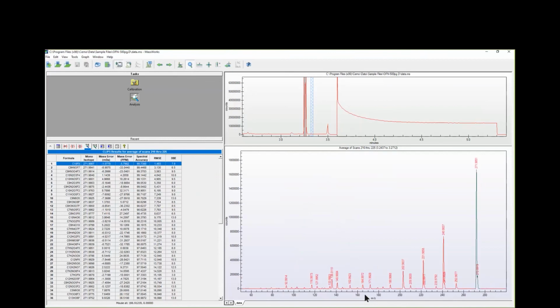Okay, so that's great. So let's say now that this is GCMS, so obviously we're doing electron impact ionization. We actually get a fragment pattern. You don't know what the unknown is. It doesn't search well in the NIST, or maybe it searches in the NIST, but it's not definitive. And you want to confirm what some of these fragments might be. And again, I don't know if you know it, but the NIST search program has a built-in little application that can actually predict what these fragment formulas are, which is actually quite useful for real unknowns to validate that.